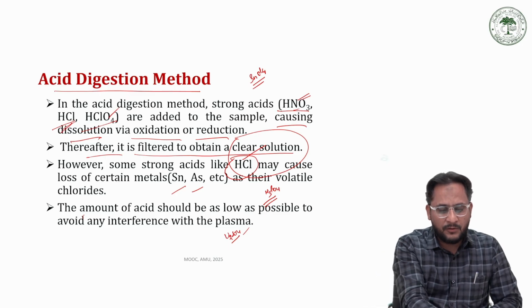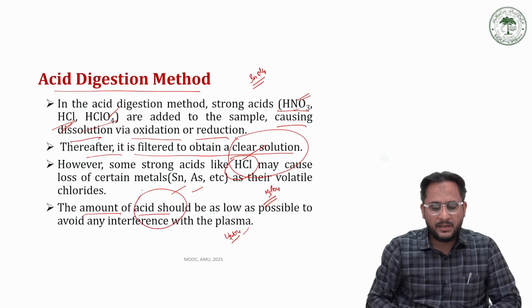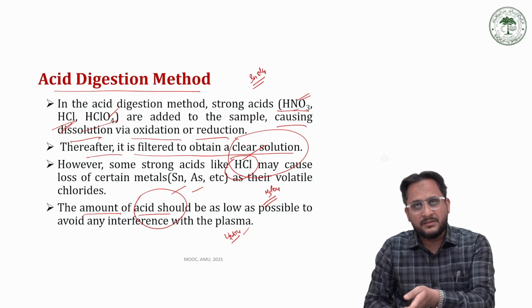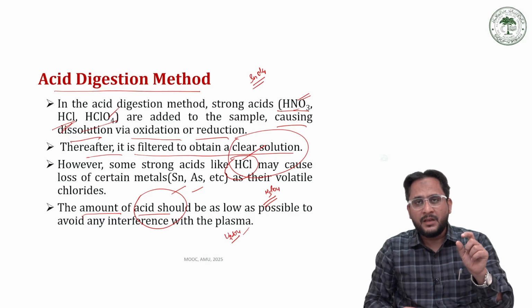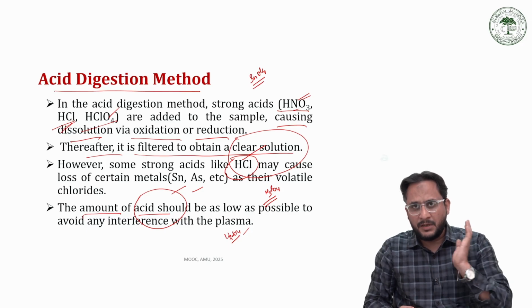Further, the amount of acid should not be very high, because traces of the acid may create some interferences in the plasma, or it may destabilize the plasma.